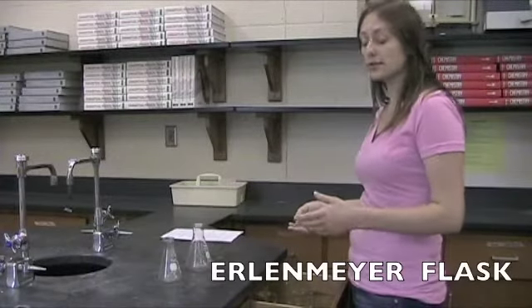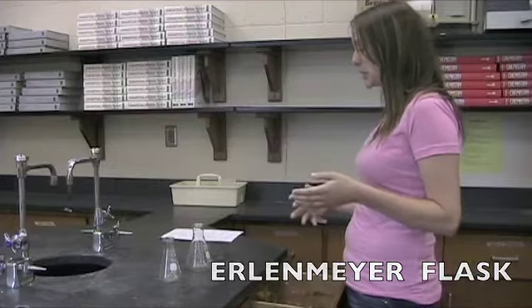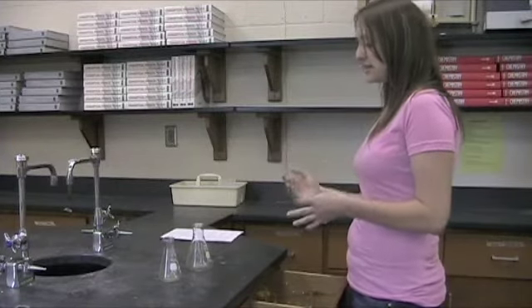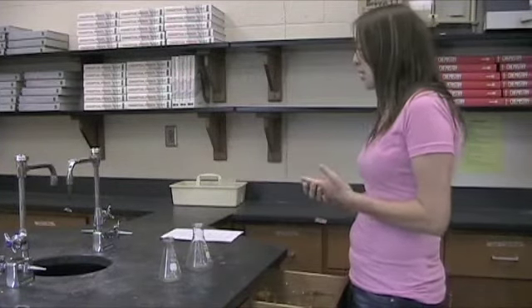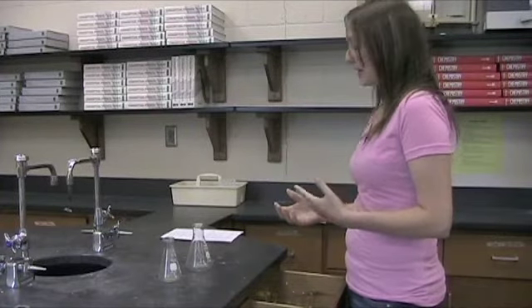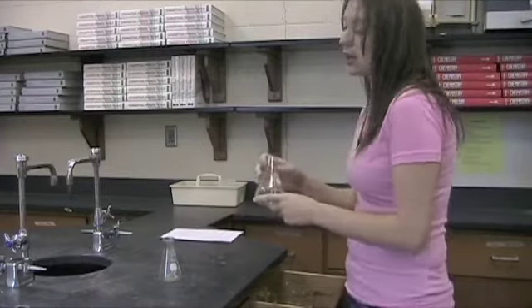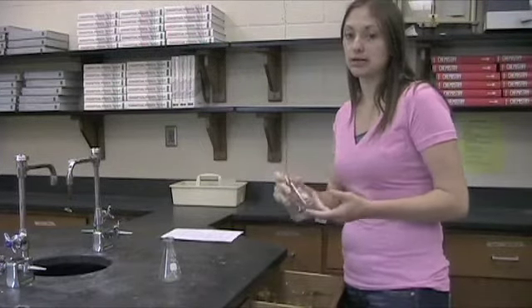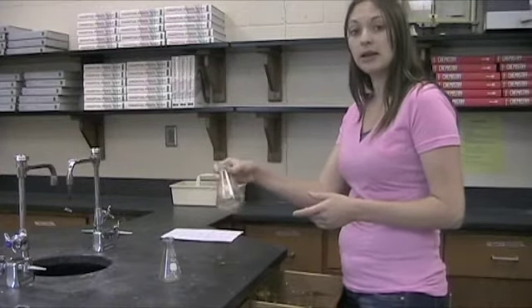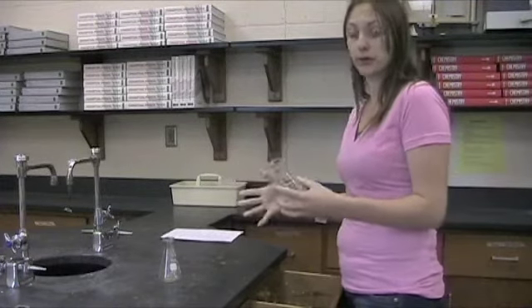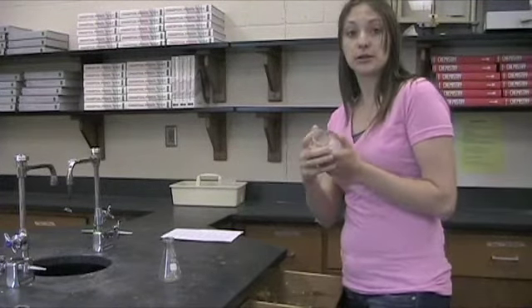Next we have Erlenmeyer flasks. Erlenmeyer flasks are very similar to beakers. They have many different sizes. You're going to have two in your drawer. They are not very exact in their volume measurements. They're very similar to beakers in that way. What they're really good for is if I want to put a liquid in here and I want to swirl it or shake it or mix it, it's very easy to do that by hand and it's not going to swash all over the place because they have much skinnier necks.